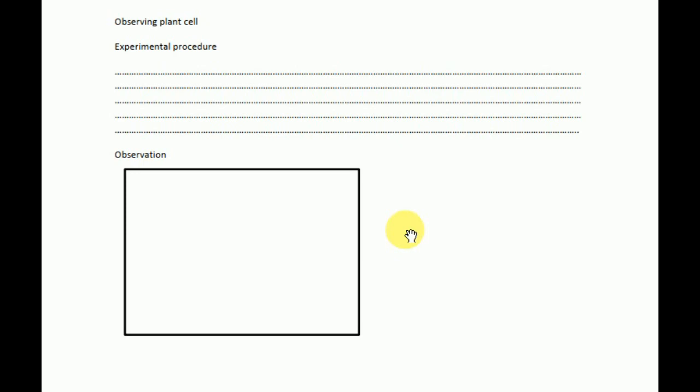So what we do is put some ink, which we call stains. A stain is put into the specimen to visualize the cells in a contrasting manner, because otherwise they are transparent. So what we do here is take a stained cell. These cells in the rhoeo plant, a bushy plant with purple-colored leaves.